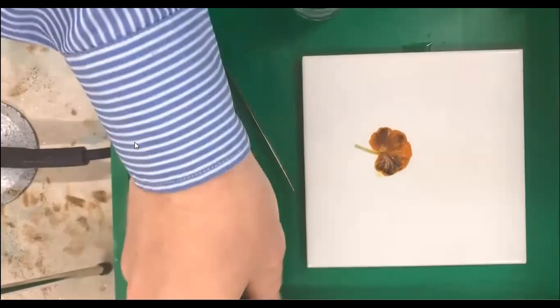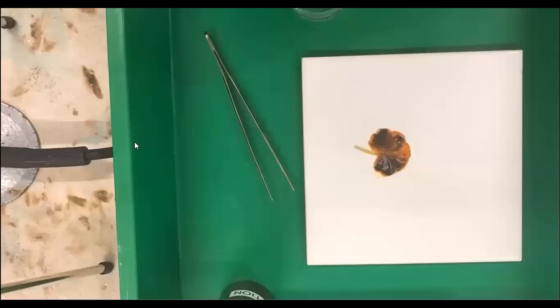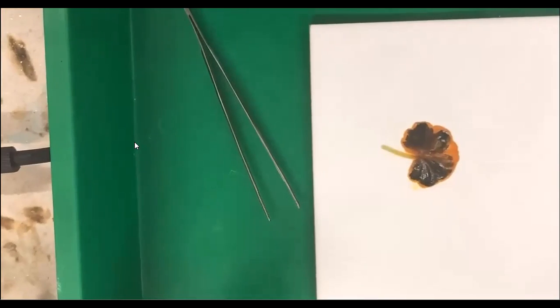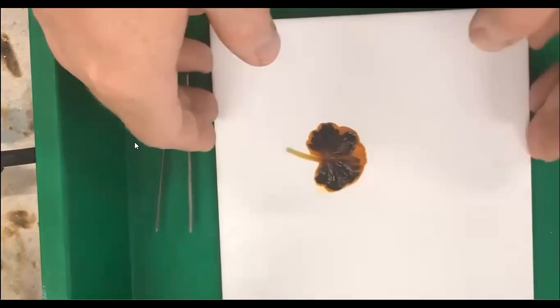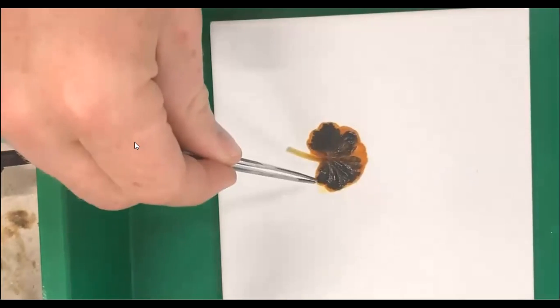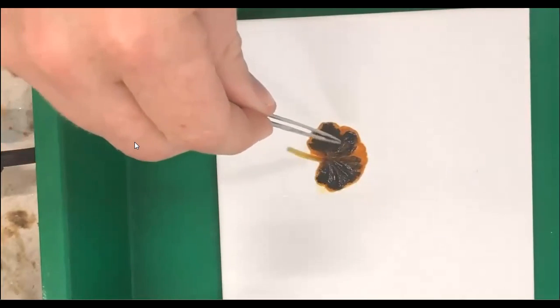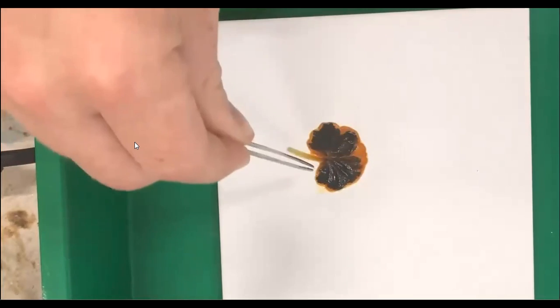We'll let the stain take for just a few seconds, and that's very beautiful. We can see that really nicely. I'll just zoom into it. Here we go. And you can see here the pattern of the starch. That's the black areas rather than the unstained orange areas.